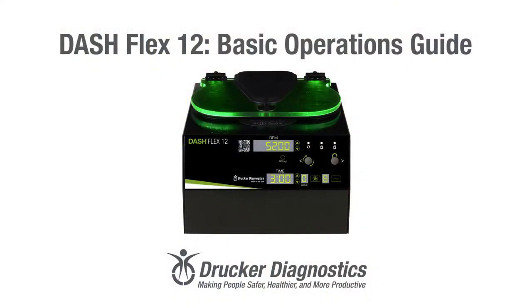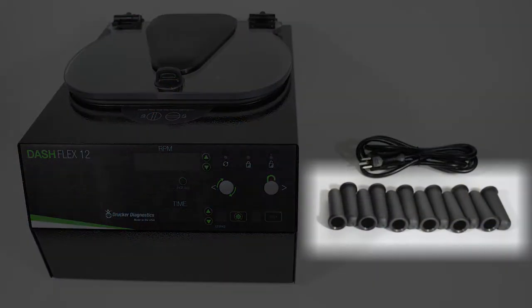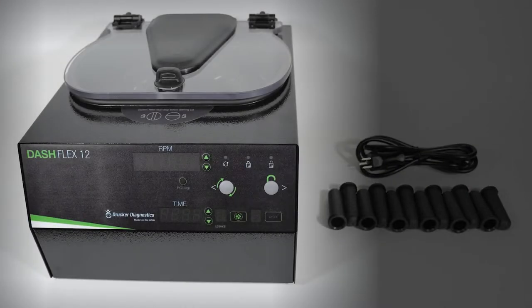Dash Flex 12 Basic Operations Guide, Part 1: Setting up the Dash Flex 12. Let's start by making sure we have all of the accessories that we need. These accessories came out of the small brown box that was packed in with your Dash Flex 12. You should have your tube holders, your cord, and your centrifuge itself. If you're missing anything, please contact Drucker Diagnostics.